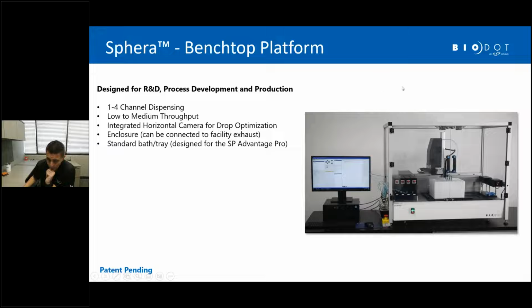It has an enclosure. Again, for people that are new to this, we are working with live liquid nitrogen, so incredibly cold temperatures. Safety is key, so we have an enclosure to protect from splash.